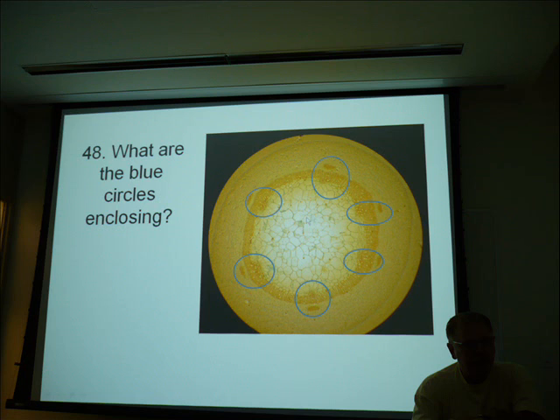Again, what would you say those are? Same thing you said. Xylem. I would say vascular bundles. So I'm gonna be lazy. Two words. Okay. But if you want to say xylem and phloem, okay. Vascular. Did you leave out cambium though? If you say xylem and phloem, what would you also say? What's in that couple? Cambium too. When I say vascular bundle, I got all of them without naming them.